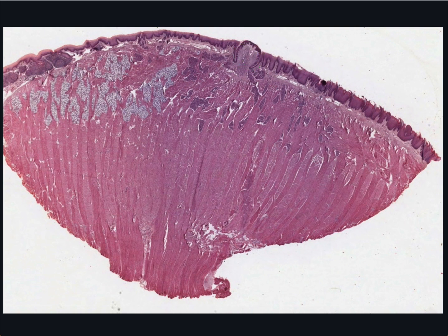Another difference is the abundance of mucus glands that happen to be quite striking here at the posterior portion of the tongue. They're actually mucous lingual salivary glands. And lastly, there's a lingual tonsil here at the posterior end of the tongue, or the root of the tongue, which I talk about in a bit more detail in my lecture on the lymphatic system.